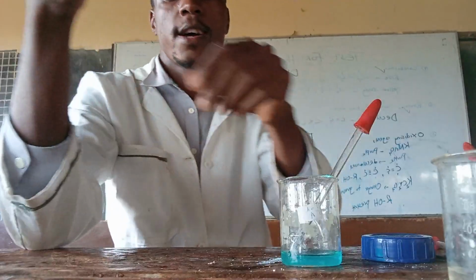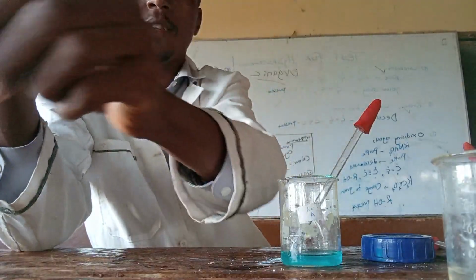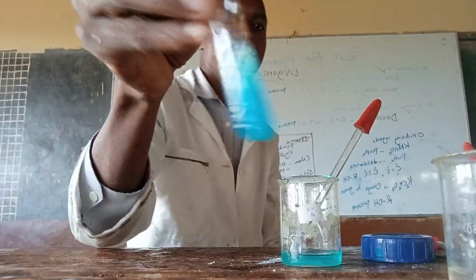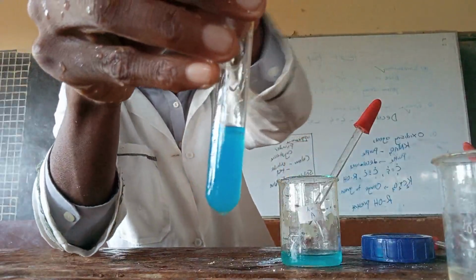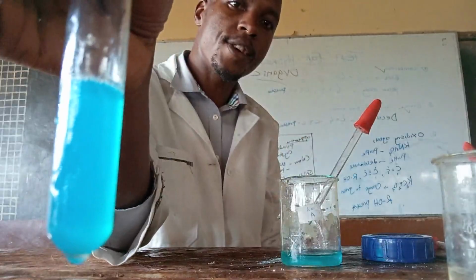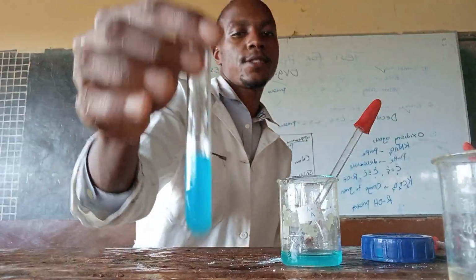What about when you add sodium hydroxide in excess? Blue in excess. Look at this very beautiful blue color. Very beautiful. This is copper ions confirmed to be present.